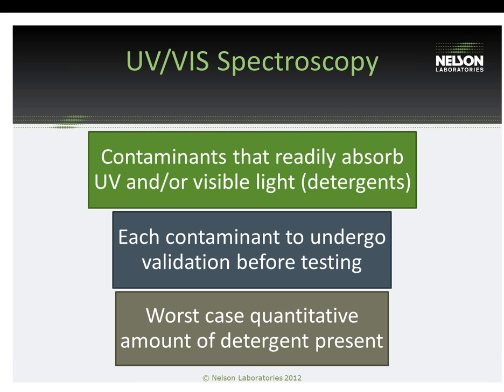We also take a stock sample of detergent, scan it as well straight onto the instrument, and then we compare the two scans, the residue that was obtained from the extract to the stock solution of detergent. And then with that comparison, we're able to report a quantitative worst-case amount of detergent that's being left over on the device.